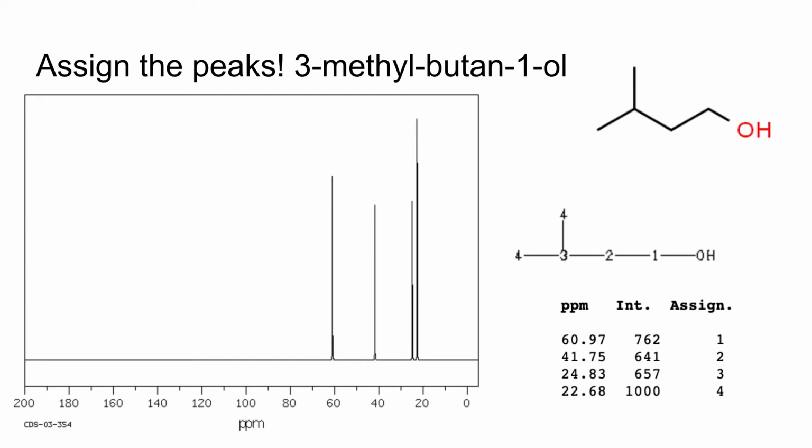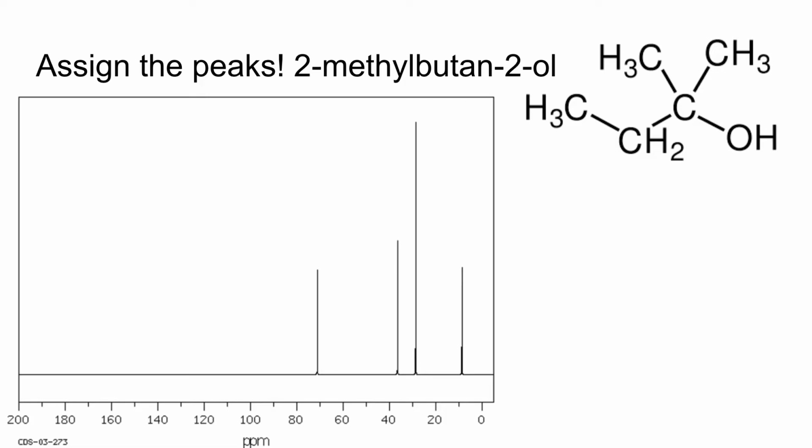I got one more for you. Okay. So once again, I'm going to put up another molecule with a spectrum, and please assign the peaks. This is 2-methylbutan-2-ol.